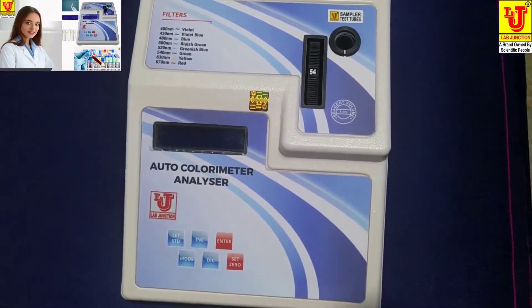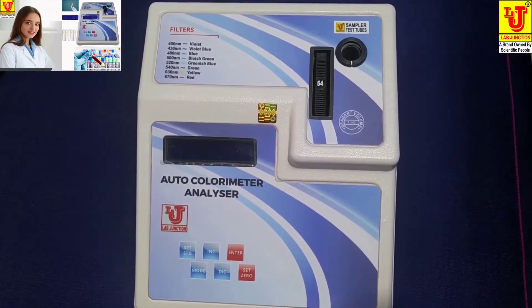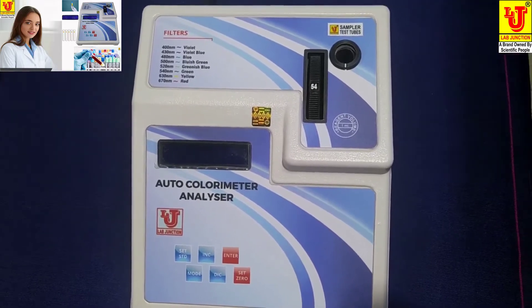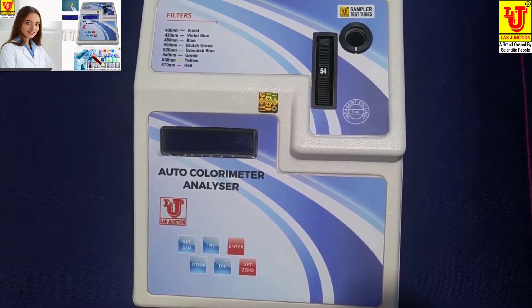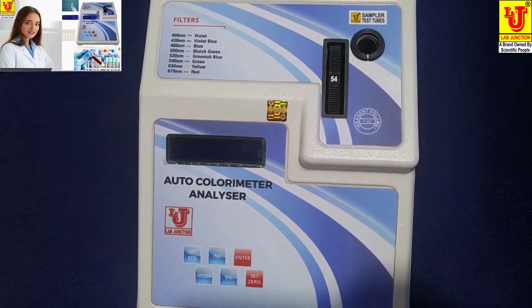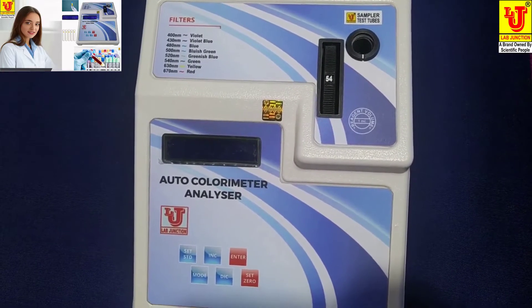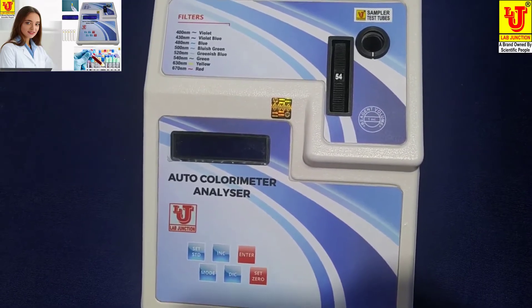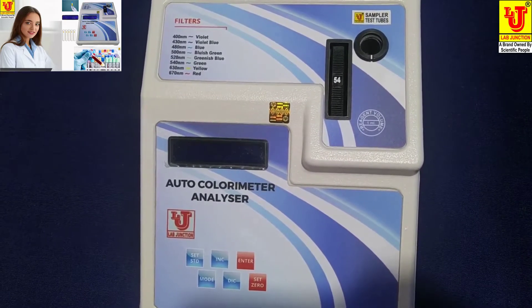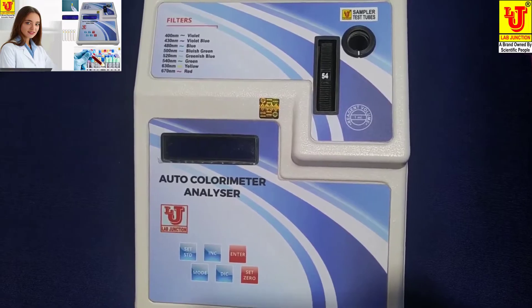Lab Junction microprocessor colorimeter, model LJ-1313, also known as the auto colorimeter analyzer. This colorimeter has facilities for absorbance, optical density, percentage transmission, and concentration. It has eight filters.